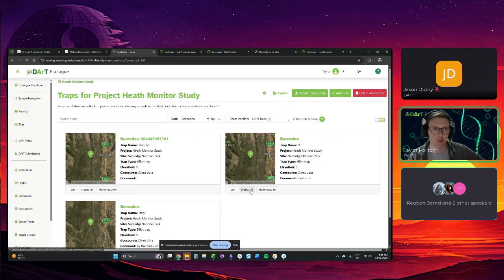And then there's events below that, and field records and samples, so on. For our uploaded data, we've got this version control that's handled by the form versions. For example, for the traps associated with this project, we've got 5 traps uploaded right now, but they were created under 2 different form versions.